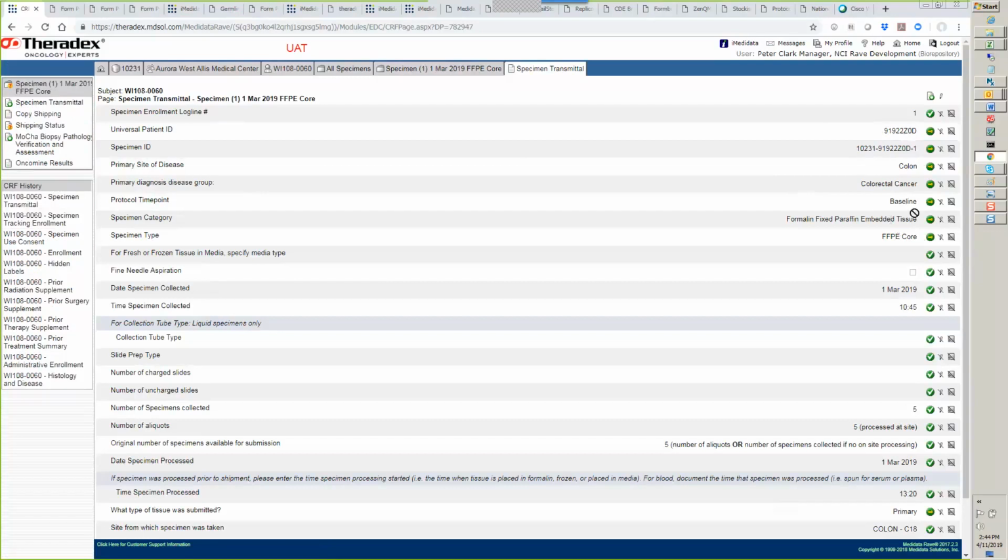Everything in this top section is coming in from somewhere else. The specimen ID is always going to be on this third line, and the first line always is going to tell you the log line that the specimen was originally entered on. Oftentimes, there's going to be a correlation between the order entered and the order collected, but it's not guaranteed.